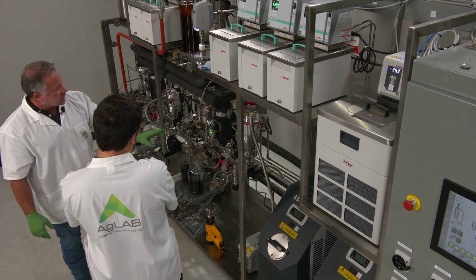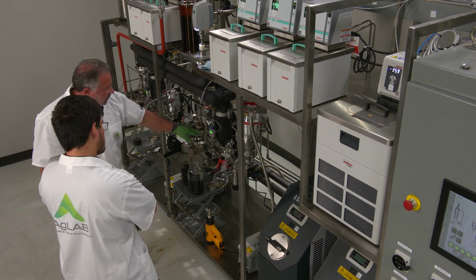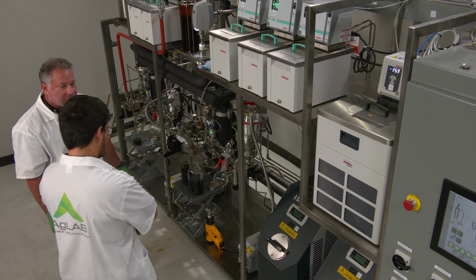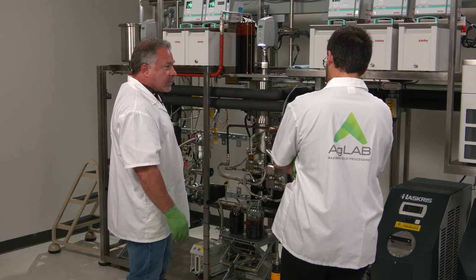We have 2 vacuum systems on this side. We have a scroll pump, and we also have a turbo pump here, bringing our vacuum down to 3 to the -2 torr is what we're looking at here. That changes what this is, essentially, to a molecular distillation system.